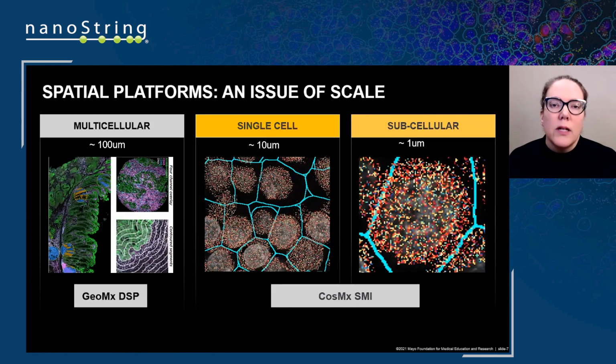So we were thrilled to have the opportunity to run this same cohort, this triple negative cohort at TMA, using the CosMx technology. So again, spatial is a big word. It means a lot of things to a lot of people. From our perspective, with the RNA reagent panels in CosMx, we were after single cell resolution, not so much subcellular. It's a different story, of course, for protein. And when we get our hands on that, we really want to see how it performs in the subcellular space.